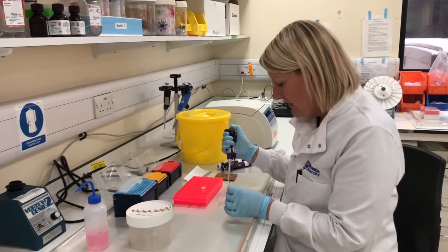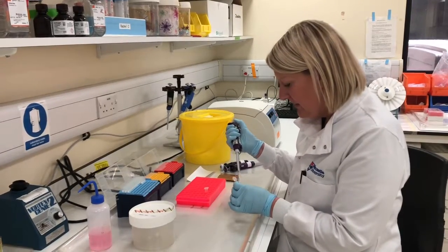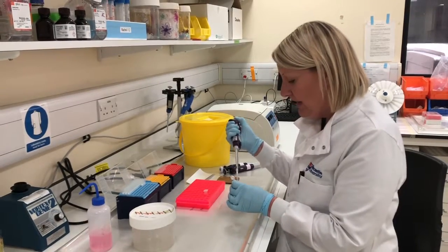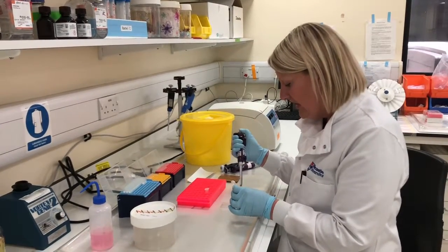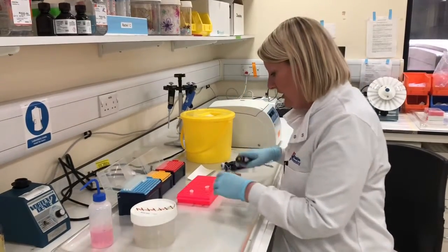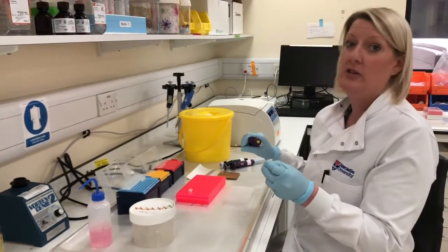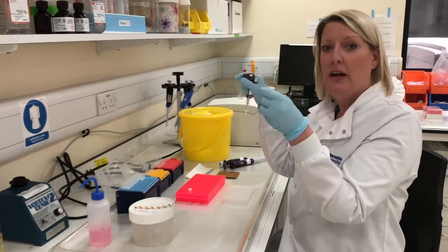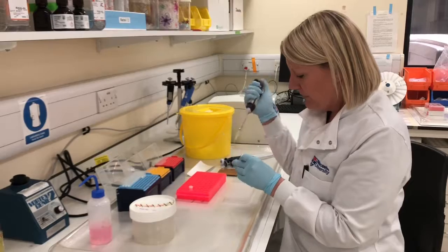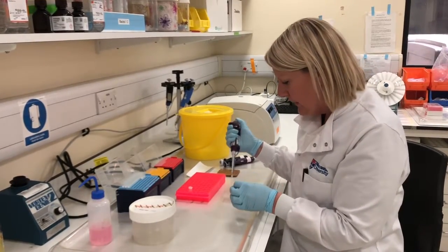So once we've added our samples to the plate, we then need to add in the assay for the genes of interest that we're looking at. So we can look at anywhere between 1 gene and 100 genes at any one time. And we have 1 gene per well, and we make up a master mix with the primers for the gene that we're interested in looking in, which actually attaches to the piece of DNA and then amplifies it so that it can be read by the machine. So we then add our assay master mix to the plate as well.